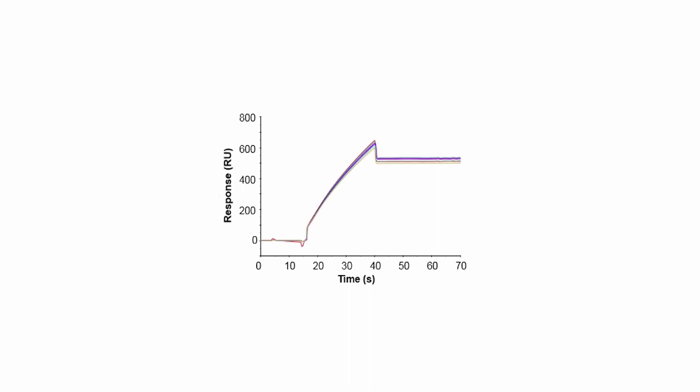When the method has finished, the capturing level is reported. This case shows an overlay plot with a reproducible capture of lipid molecule complex on sensor chip L1.